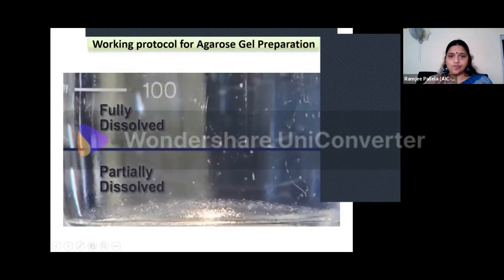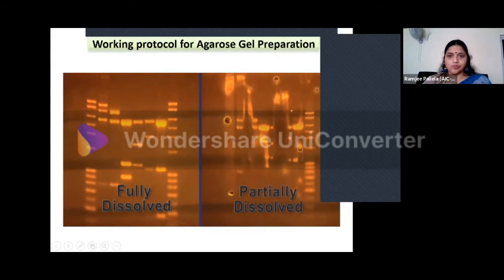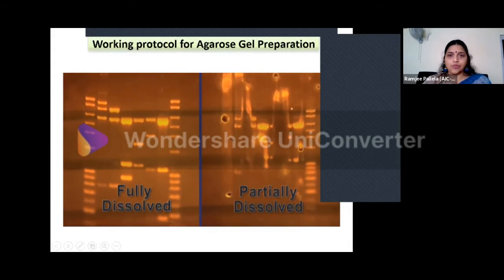The agarose is only fully dissolved when it's completely clear. If you don't completely dissolve the agarose, your finished gel will have regions of different concentrations, and your nucleic acid samples will not separate. Very important step. This is very important. We really feel that it is nothing, but we just have to mix and just heat it or boil it.